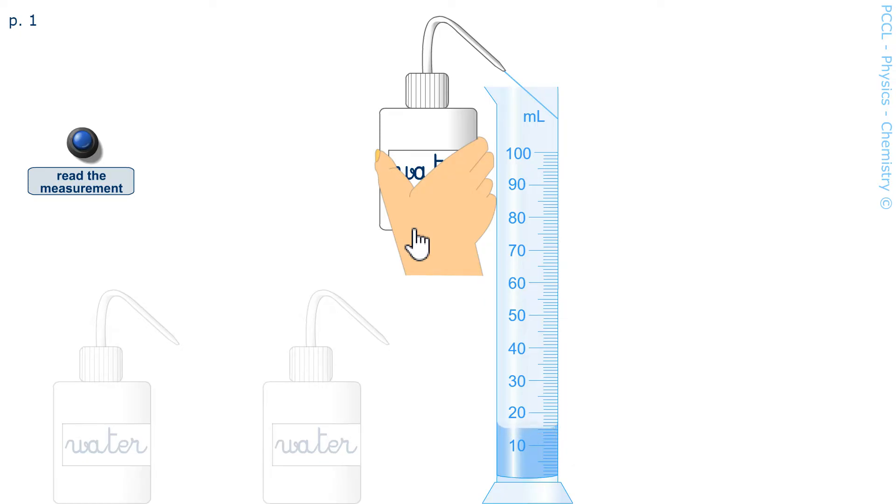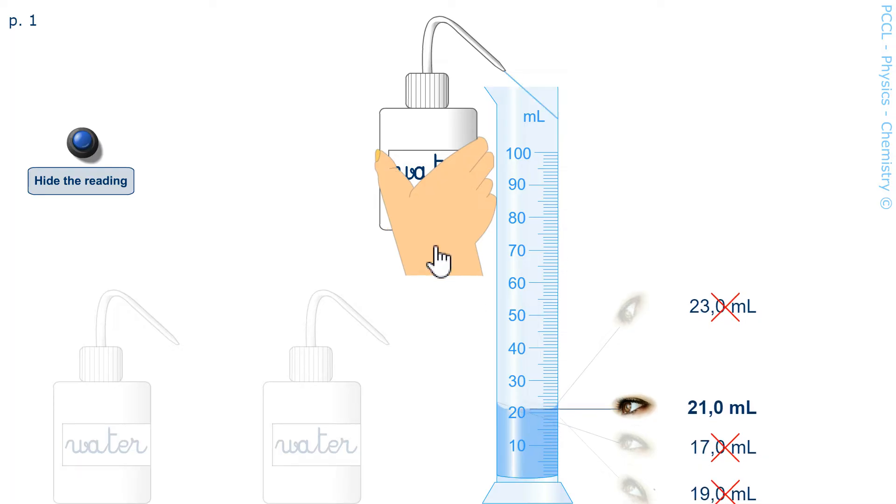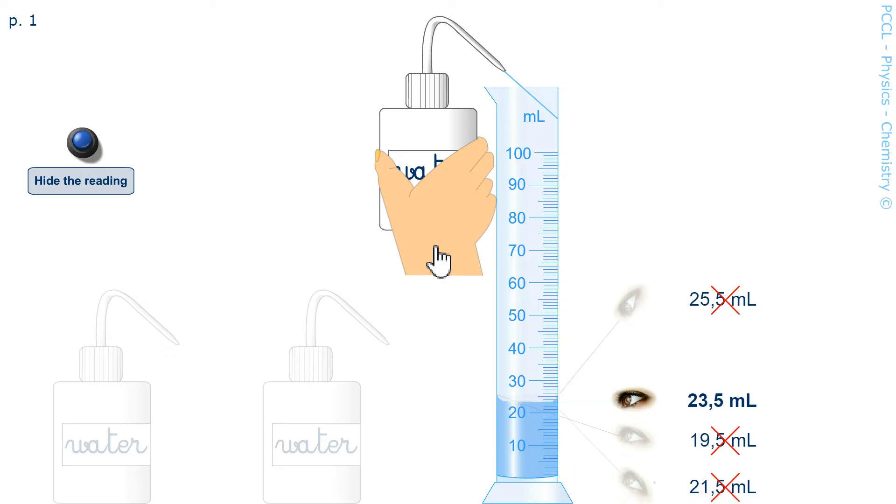The reading must be done with the eye at the height of the top of this column and at the bottom of the meniscus. This concavity is called a meniscus, which is observed when the liquid is in a container of narrow section. If the eye is placed too high, we are making a mistake. If the eye is set too low, we can also make a mistake.